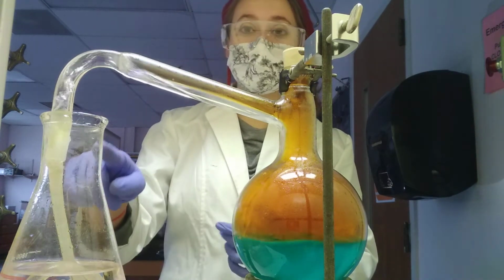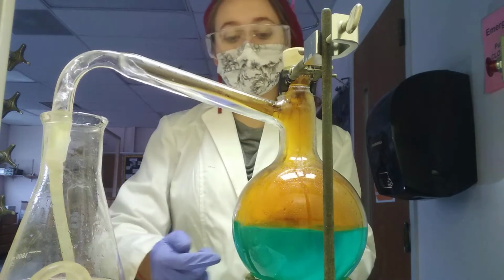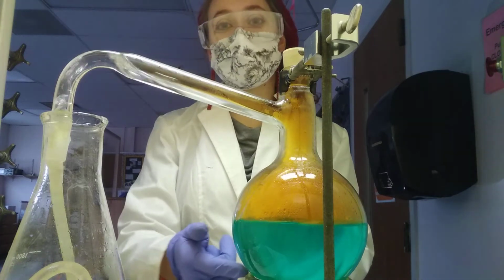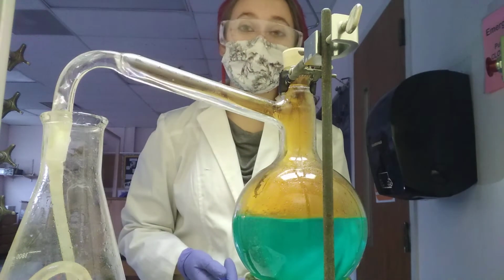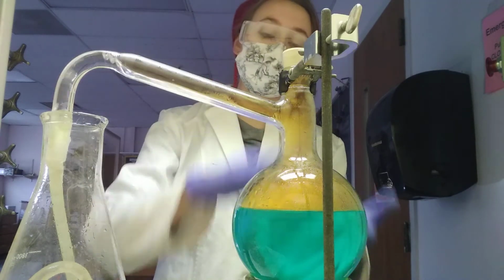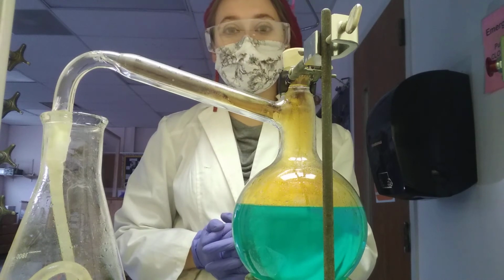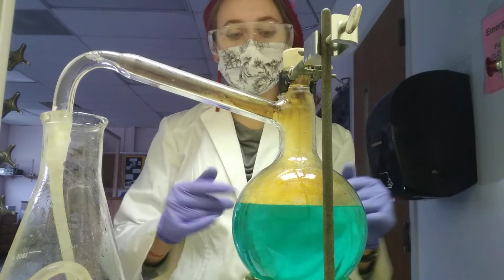You can see the water level dropping dramatically here. And we had that very small greenish line. That was the copper nitrate that formed. And so the water is diluting it, giving us this blue colored liquid.